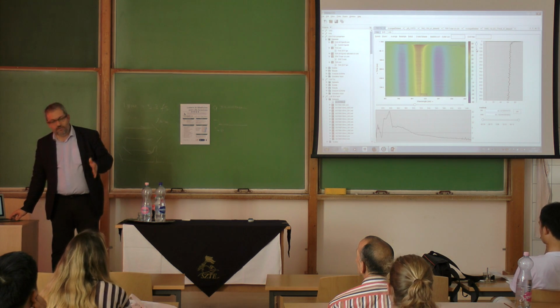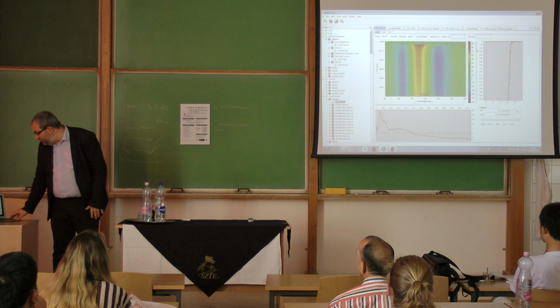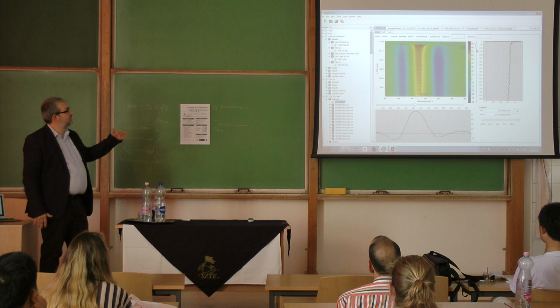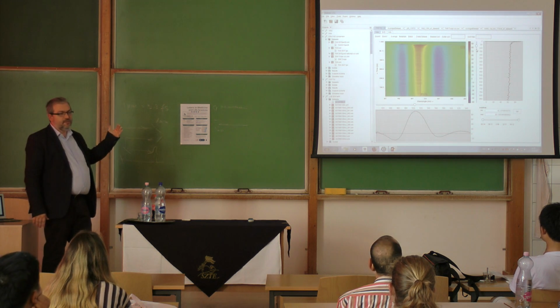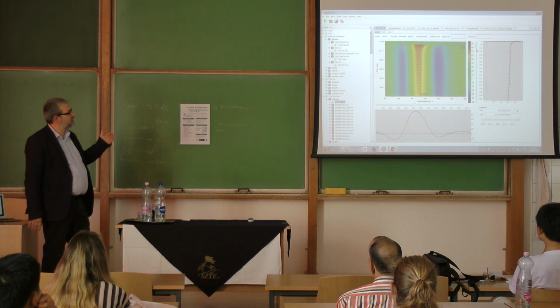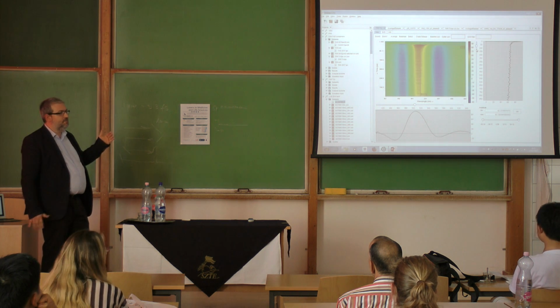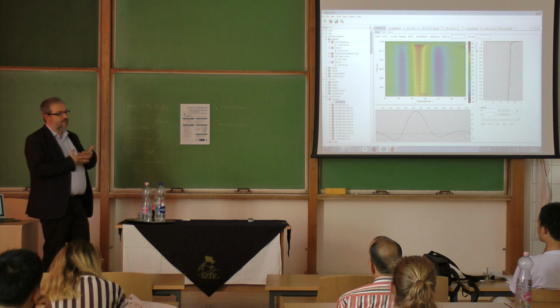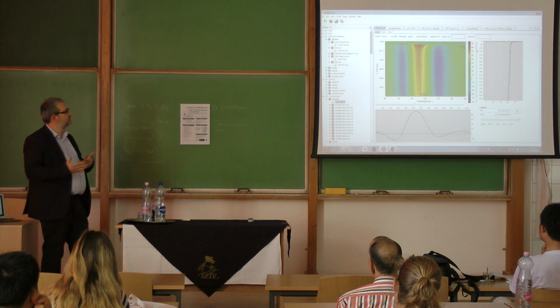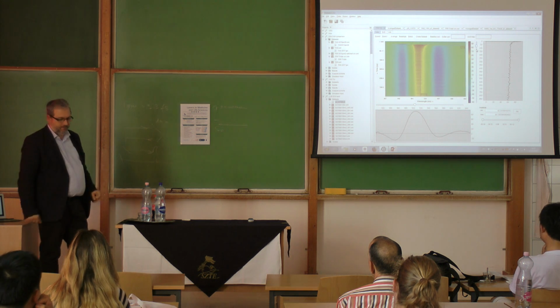Then we said, okay, zero, because this is where the pulse arrived. Due to the overlap, we have this coherent noise. This is traveling, and that's it. This is already your real signal. The problem, of course, is that you lose your first four spectra and cannot analyze them because they were involved in the noise. The better your resolution, the less you will lose at the beginning due to the overlap.